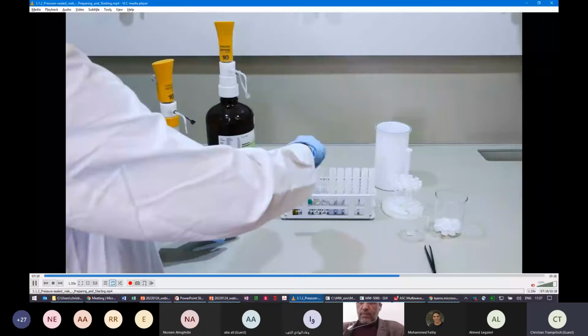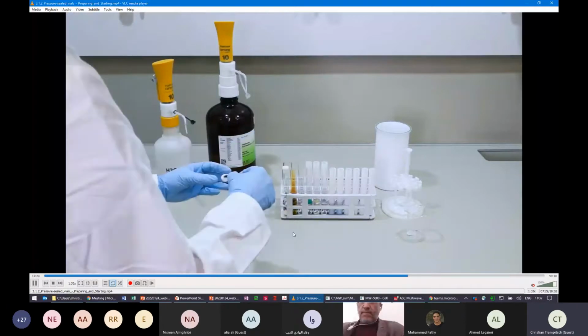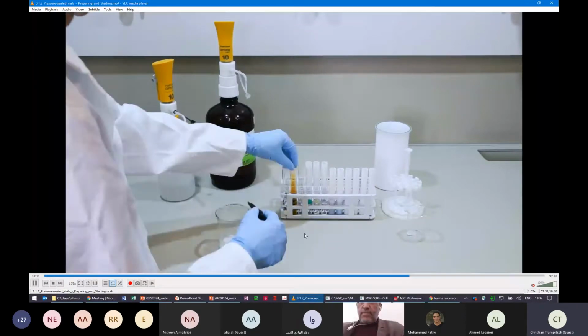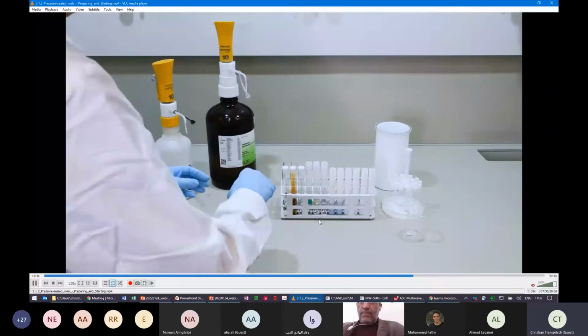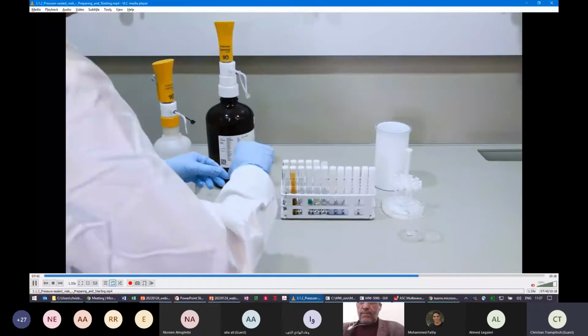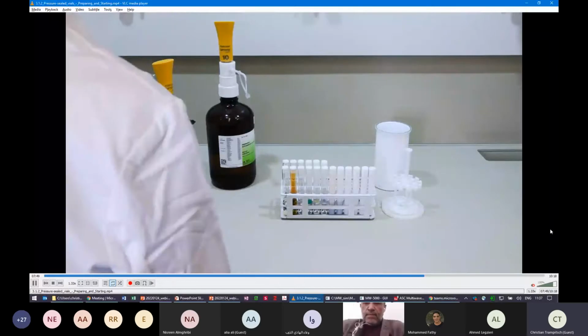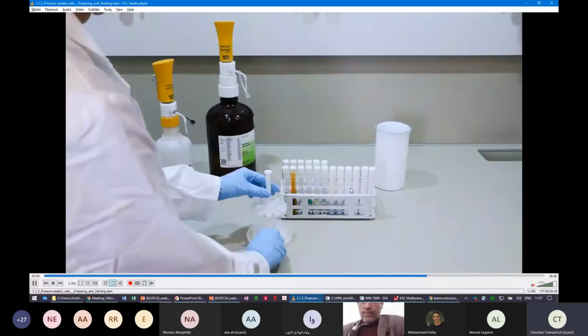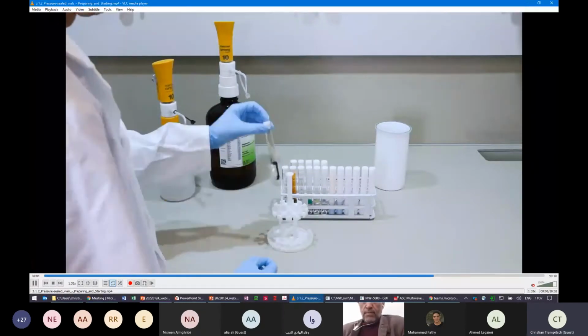Okay, everything is filled. Closing: you see, one of the vials already starts to react. Okay, that's no problem. We close them with the plug-on caps. You see that the closing procedure is very easy. You just put them there on top. Nothing special. That's it. You load the rack. The good thing is you can completely load the rack. You can use 1 vial, 2 vials, 5 vials, whatever you have to do. So it's again very versatile.